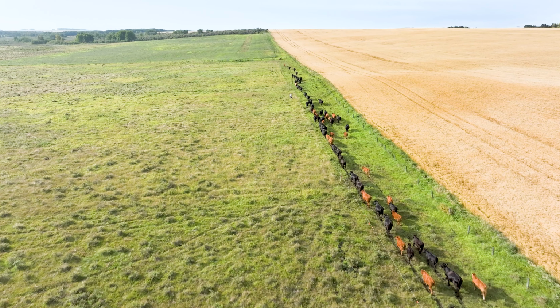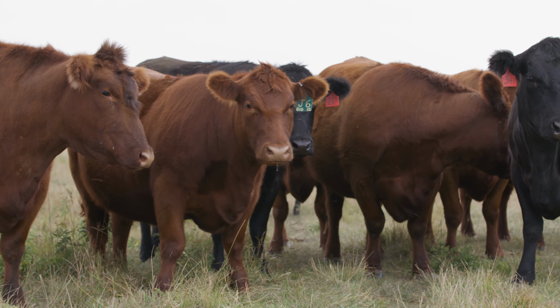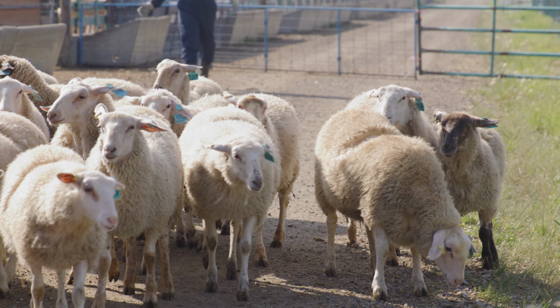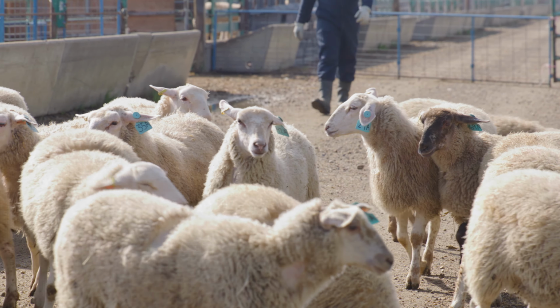Elevated nitrate levels in forages can compromise an animal's blood oxygen carrying capacity. This issue can stem from various factors, be it environmental conditions like drought, frost, hail, or agricultural practices such as excessive fertilization. The consequences can range from chronic issues such as reduced appetite and productivity to acute toxicity such as bloating and fatalities, as well as abortions. Ruminants such as cattle, sheep, and goats are at a higher risk than non-ruminants, so it's crucial to monitor nitrate levels in a variety of forages such as cereals and grasses.